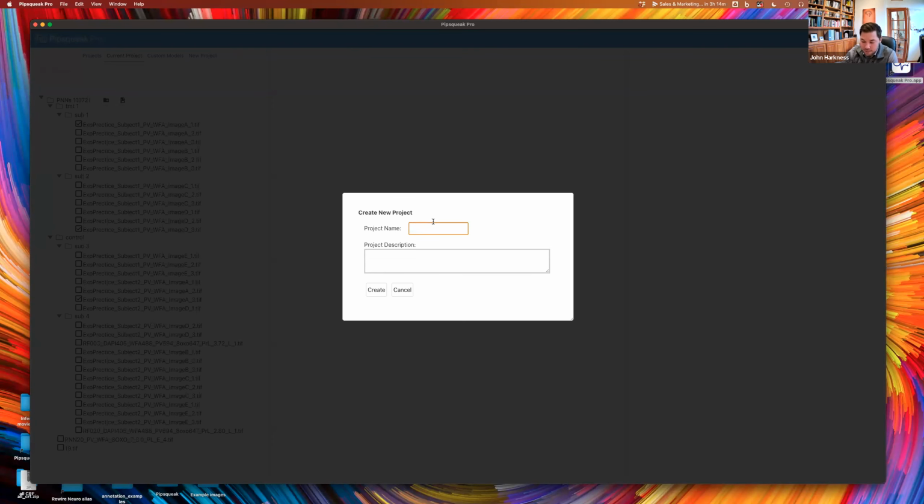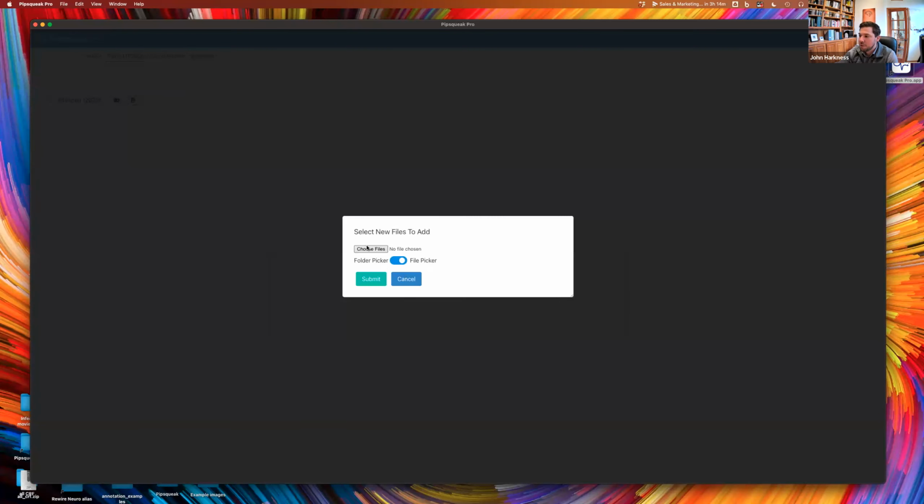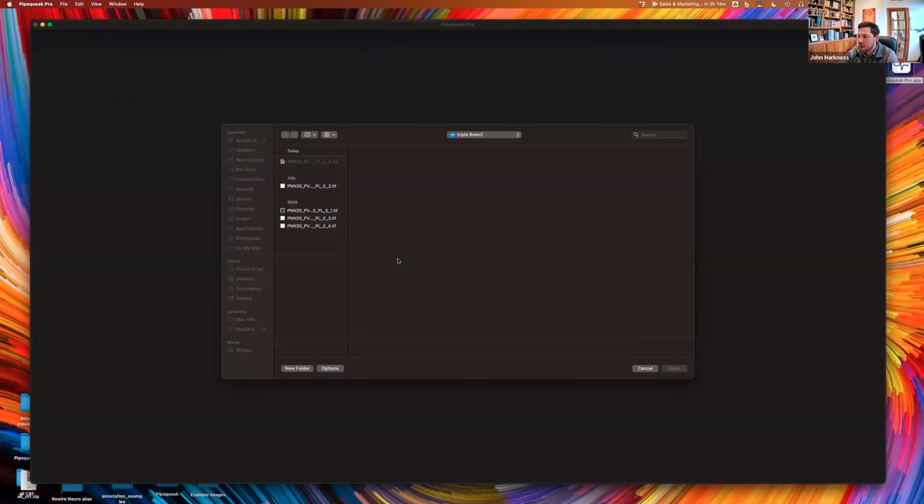So I'm going to call this John's PNN analysis on what's today's date, the 7th. So I can just pop that in there. I could even give it a little description if I wanted to. And as I create that, I'm now in my new current project. That's today's project. So I'm going to go ahead and just upload a couple images to this.